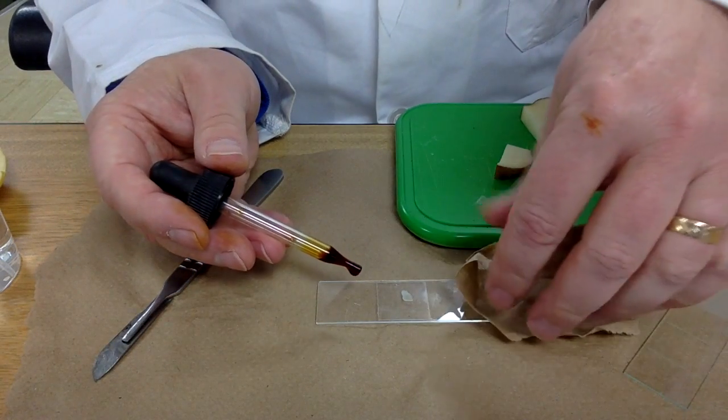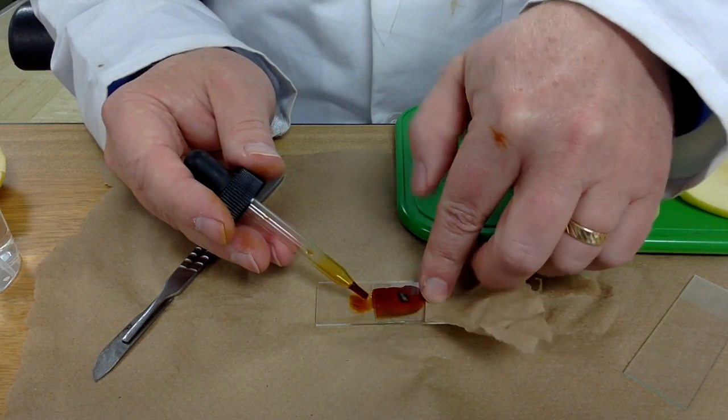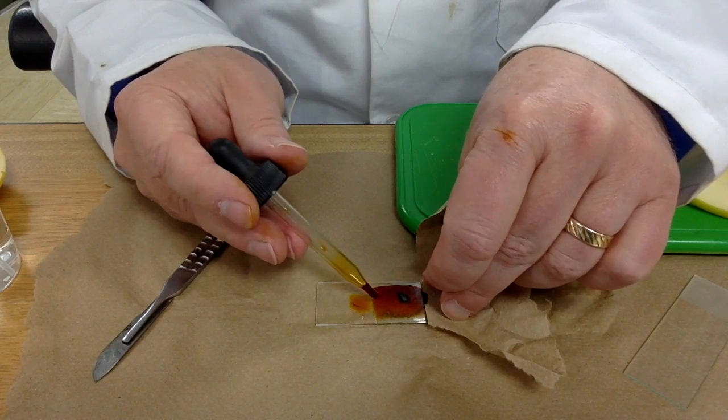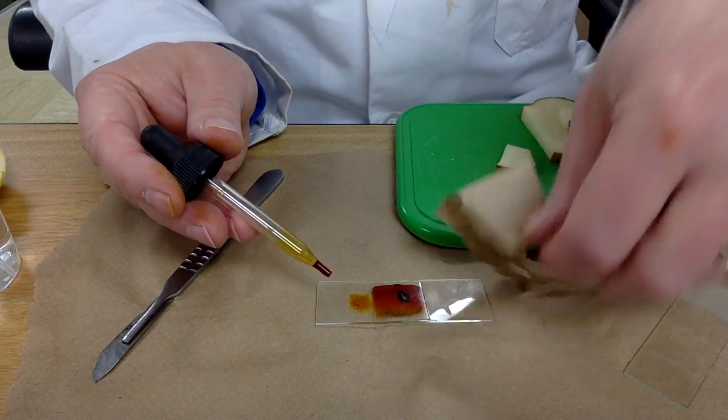While you put a drop to one side of the slide, you can hold the paper towel on the other side. That will help draw some liquid through and thoroughly stain your specimen.